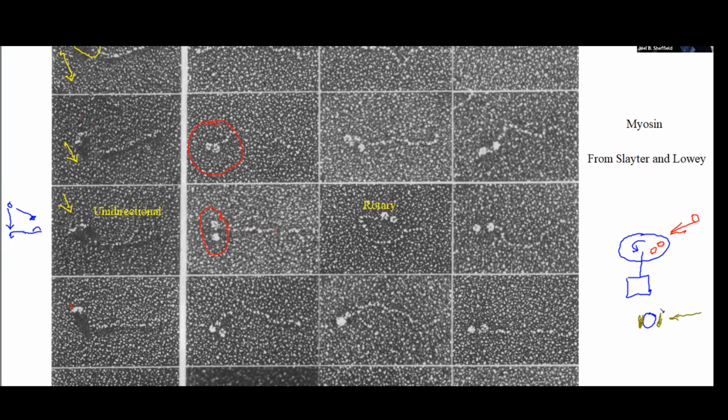You'll see that what goes on is that the middle has no coating. And so the middle of that sample over here, whichever one I'm looking at, shows up as discrete particles. And now I can pretty easily see that there really are multiple, in fact, 2 heads on the myosin molecule.